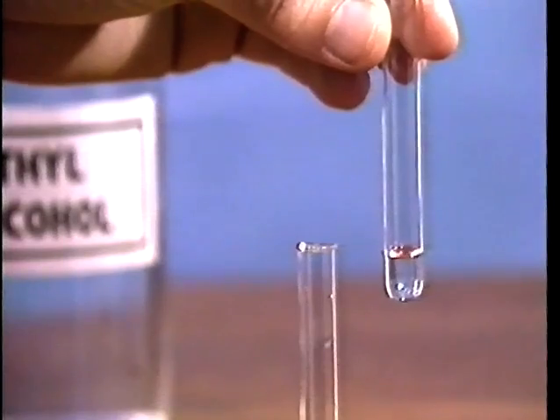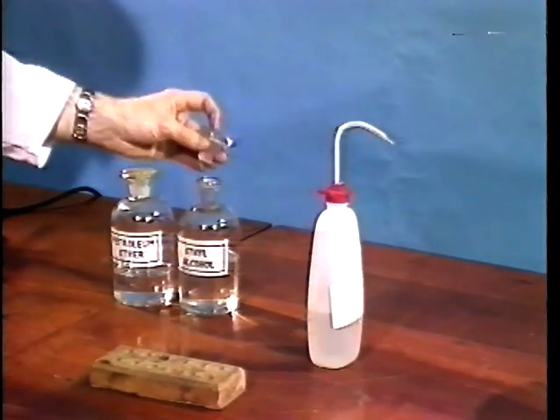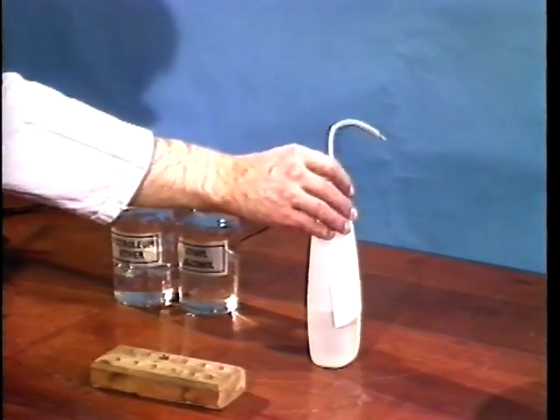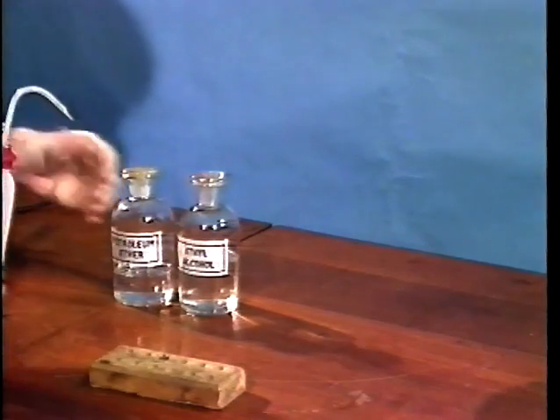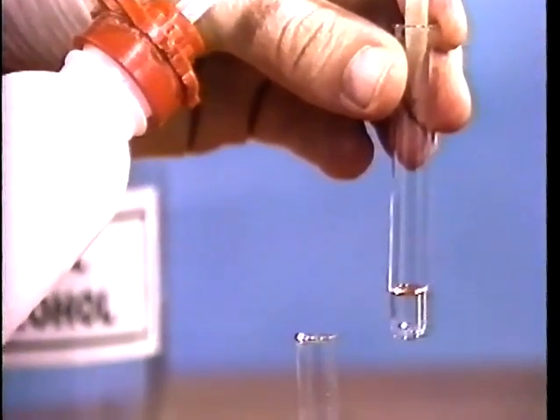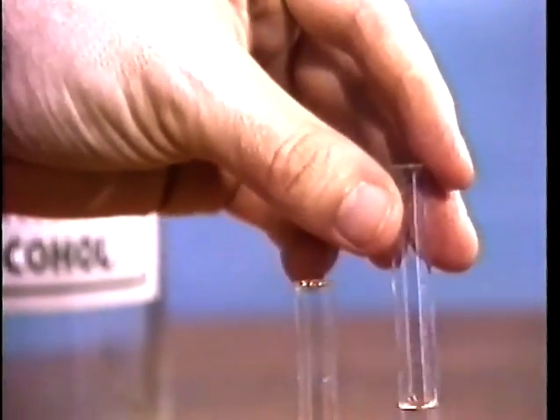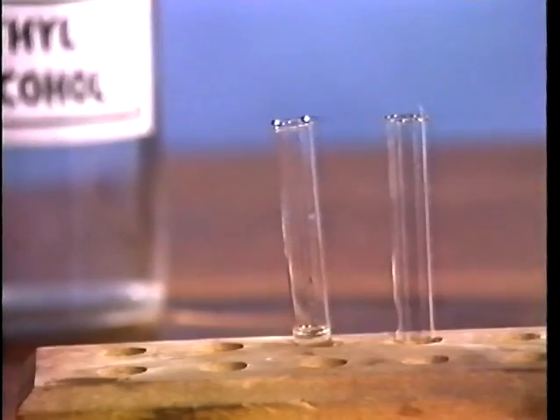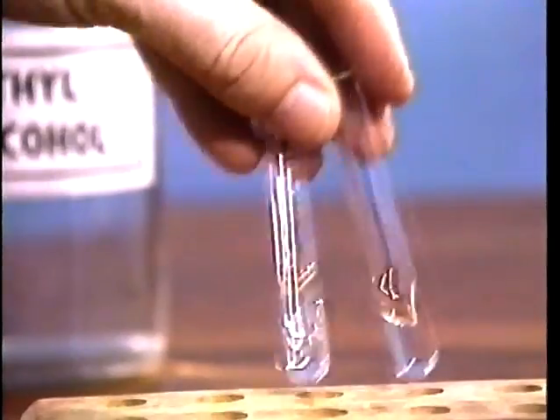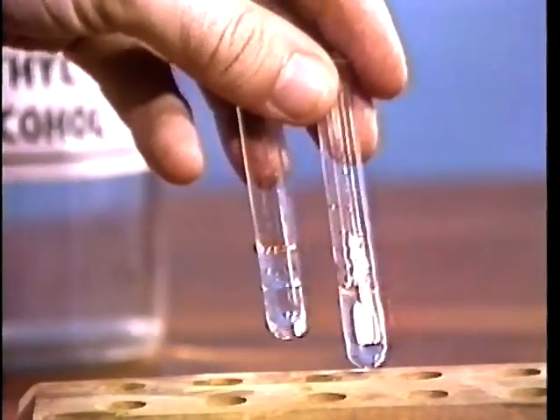The solvents must be completely miscible, as in this case. Thus the solvent mixture on the right could be used for recrystallization, but the one on the left cannot.